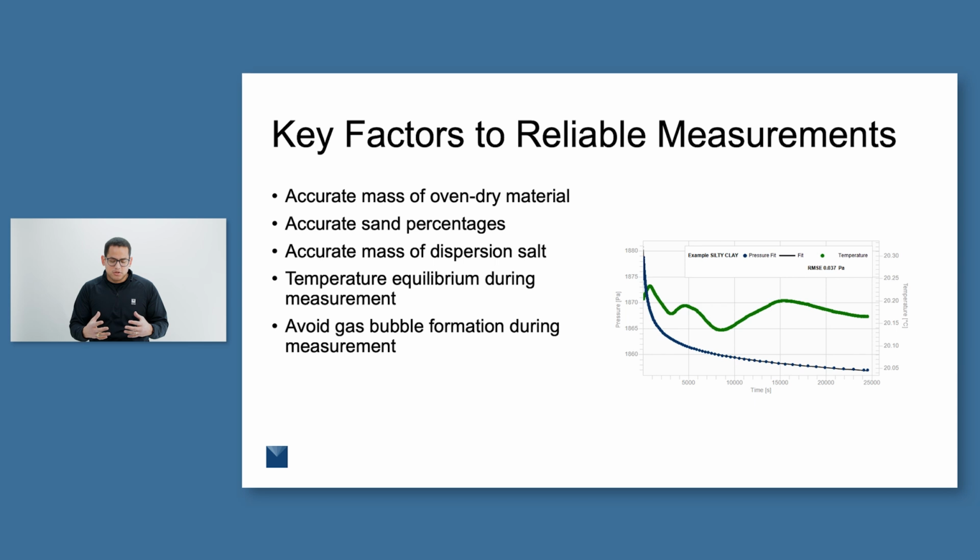So the best thing to do is, one, have a large container of your DI water that you're using to fill everything in the same room that you're making the measurement. That way it comes to equilibrium with the room temperature. It's also important that your sensors are maintained at that same room temperature when you're starting your measurements. That way you're not getting any large fluctuations in the temperature of the solution, and then you try to maintain that temperature throughout the measurement.